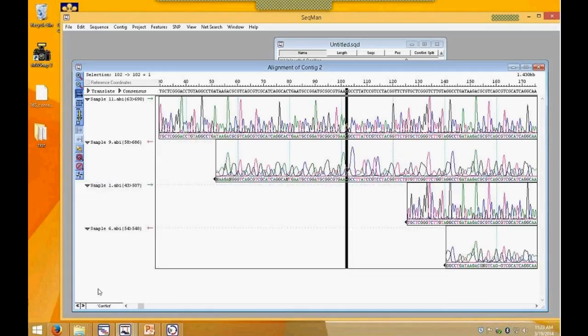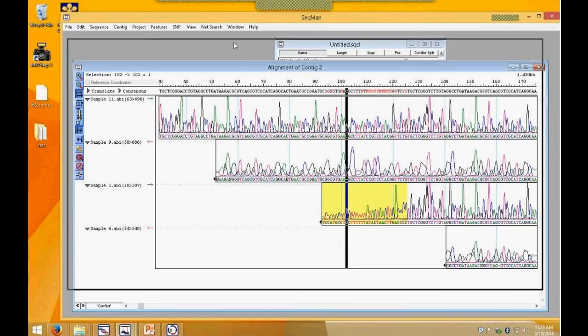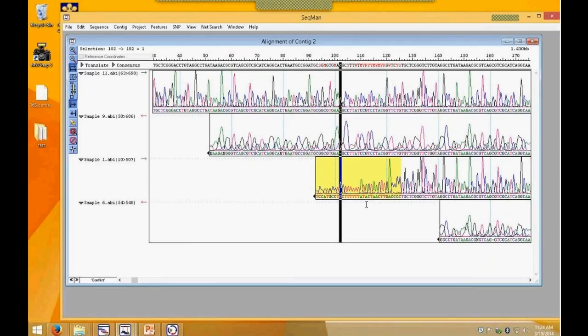Okay, and then I can go to the next conflict. Another thing I can do is you see that these ends of these sequences have triangles on them. What's really nice about SeqMan, and before I worked at DNASTAR, I did a lot of manual editing like this with a program that when you trimmed, it was lost for good. And it really was a hindrance because I couldn't go back and extend trim ends. Now, when I extend this end, look what happens.